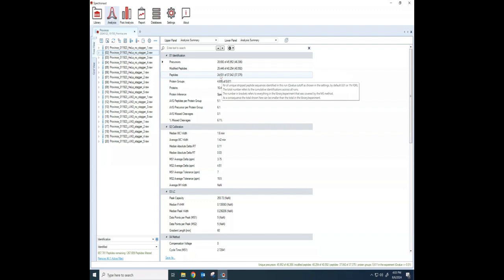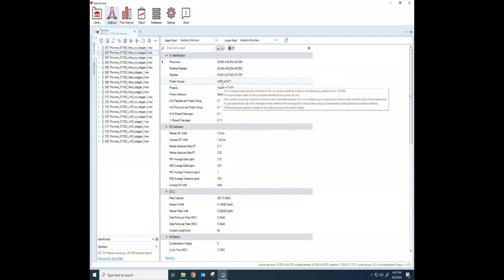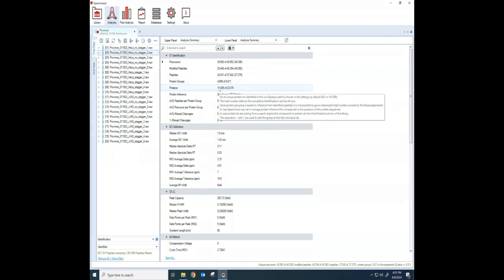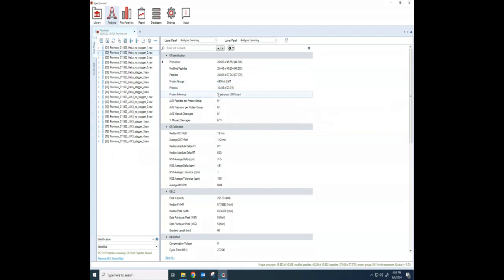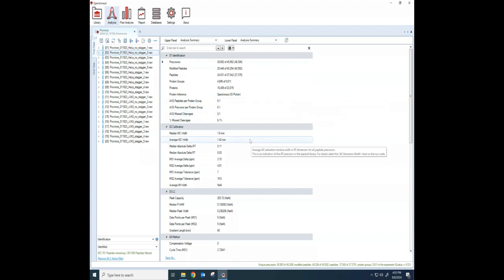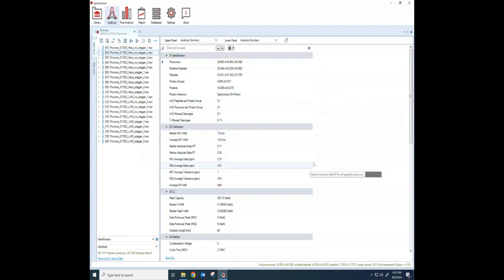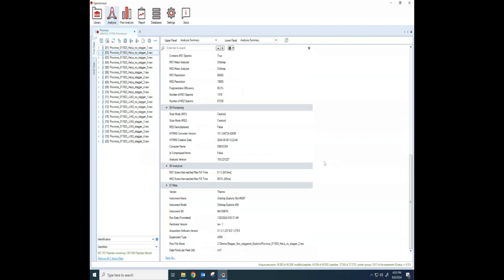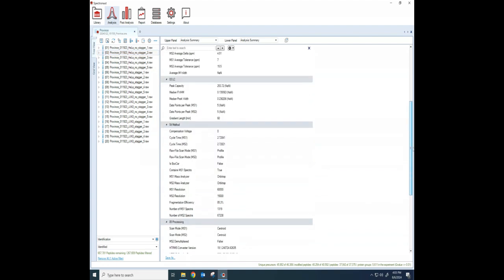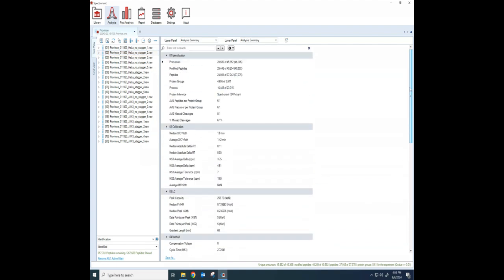The number of protein groups that we have out of the total number of protein groups, the number of proteins, and lots of QC data here that you can look at. I'm not going to go through that any more than just to let you know that that's here under the Analysis Summary.